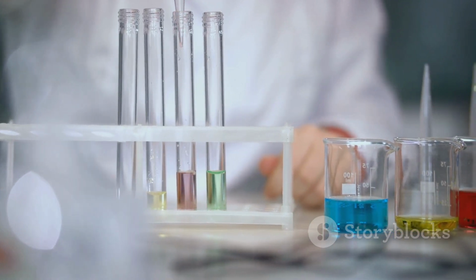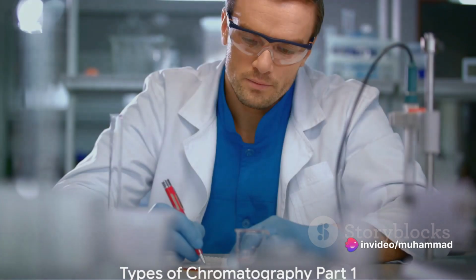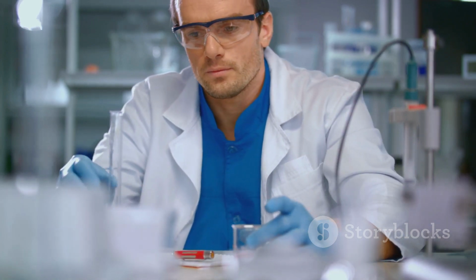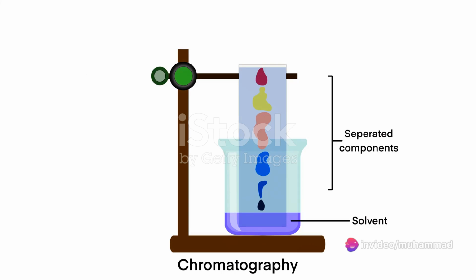Now that we've set the stage, it's time to delve into the different types of chromatography. Chromatography is not a one-size-fits-all method. There are different types based on what you're trying to achieve. First, let's talk about liquid chromatography, a powerful technique often used in the pharmaceutical industry and environmental testing.